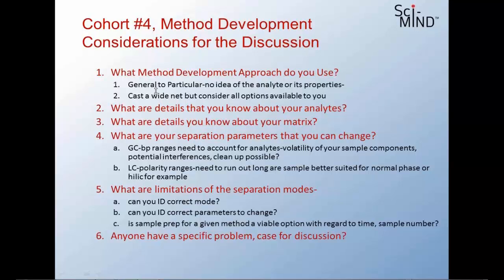But the problem is having one of these tremendously long columns. Historically, before a lot of the advancements in columns with, as you mentioned, particle size, people got the impression that you just increase your column length and that's going to really help. But if you consider the Van Deemter, it's only really a square root. You only speed it up by the square root of 2, essentially. By doubling the length, it's not going to really buy you much.